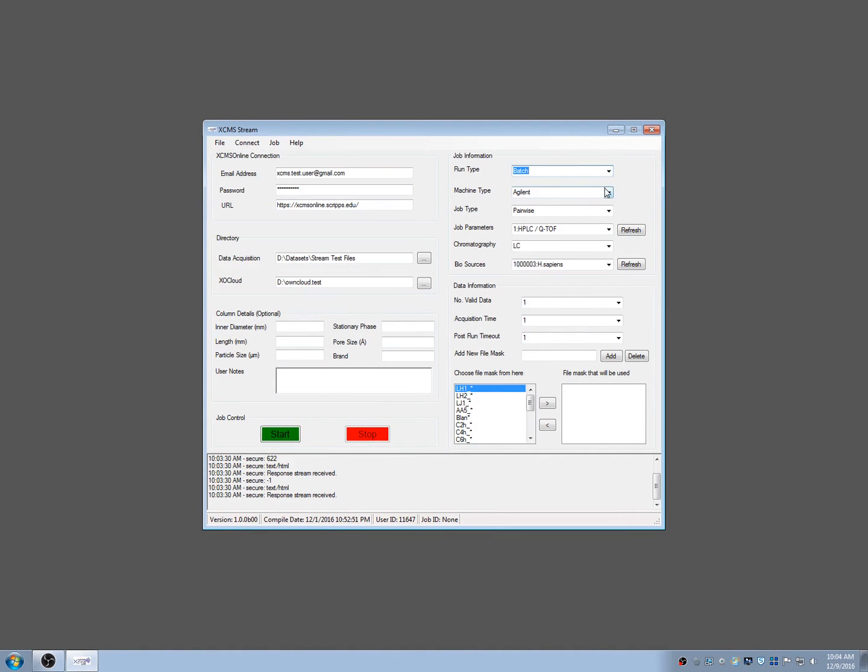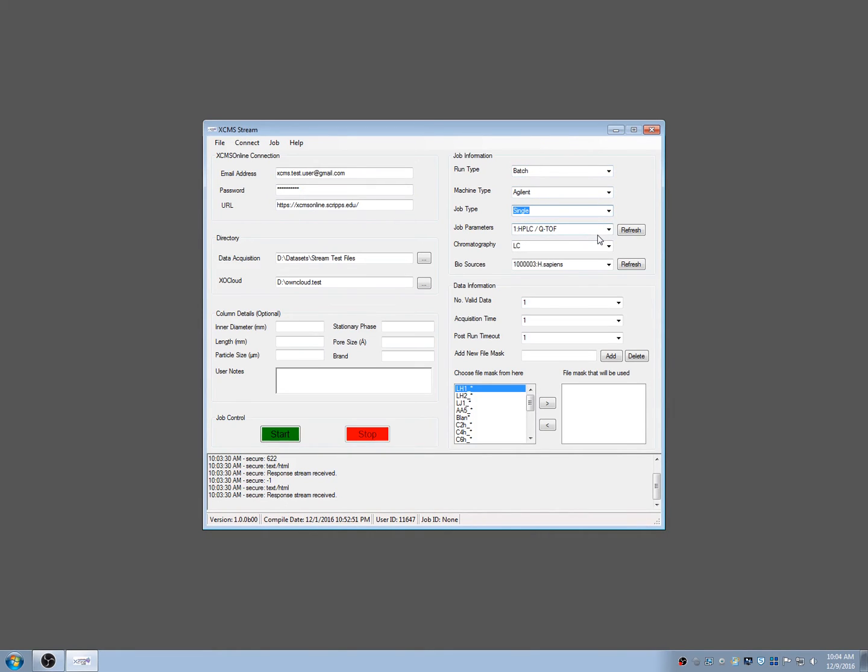Next, determine the type of XCMS Online job to be performed such as pairwise or multigroup, the parameters, the machine type, and so forth.